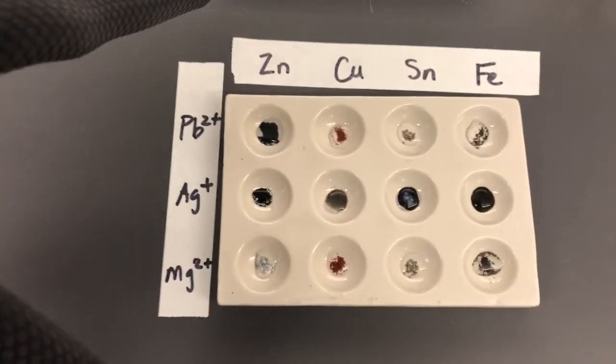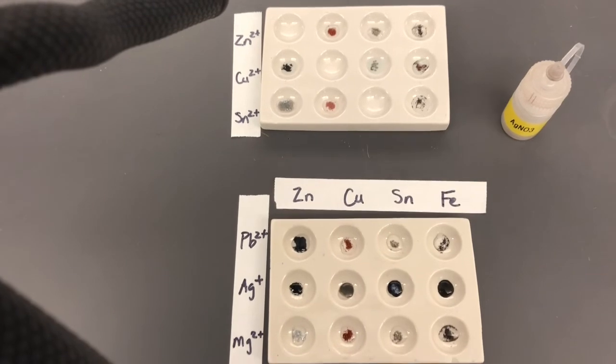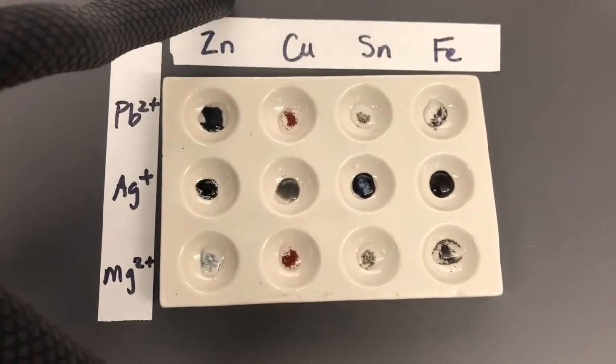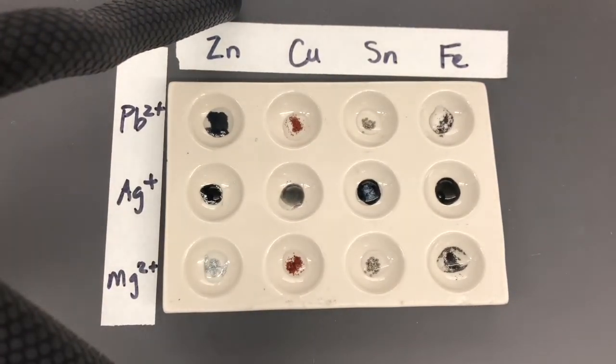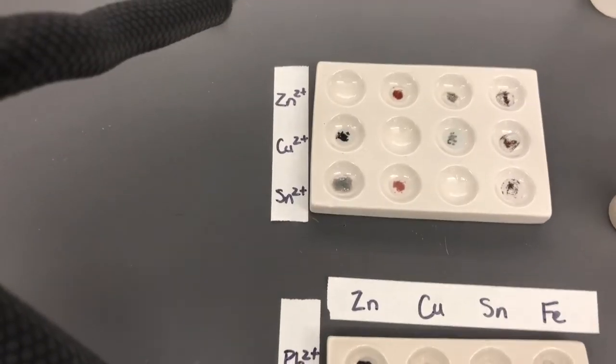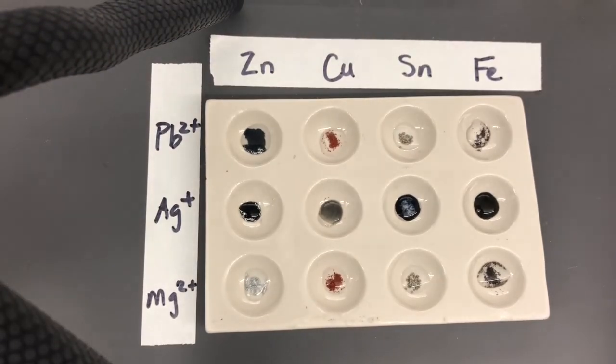So we can stand back for a moment, forgive my tripod, and look at all of our reactions all at once. Now what you're going to have to do is tie all of these observations together to figure out which types of half reactions are more reactive than others, which of the metals is the strongest reducing agent, which of the cations from the 6 that you had to choose from was the strongest oxidizing agent, and we'll compare that with the literature value and some numerical values for electrochemical cells from part 3.